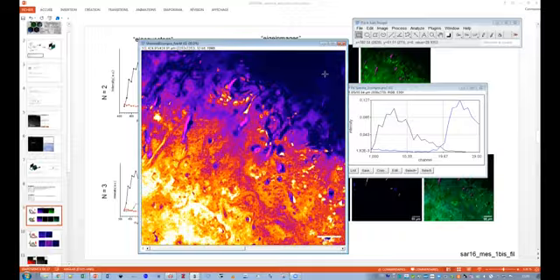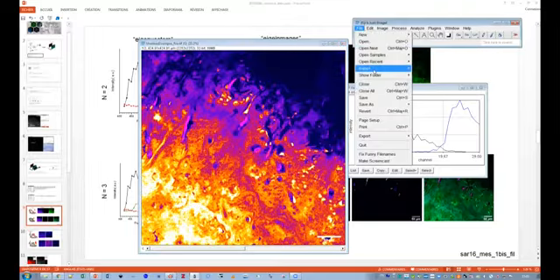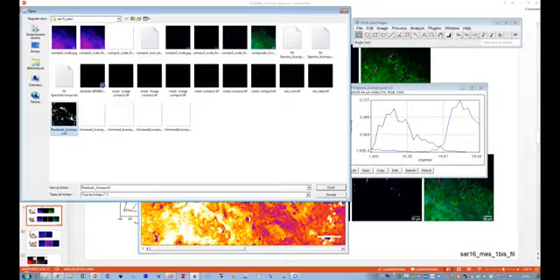No, usually what I do is really exploratory, but what I did, I checked the residual. The residual is the difference between the eigenvector and each value?